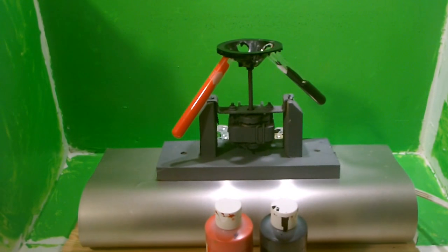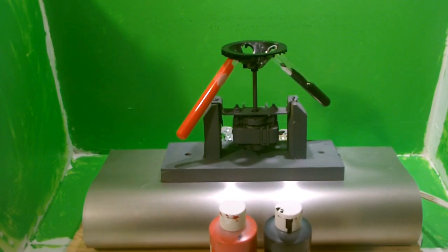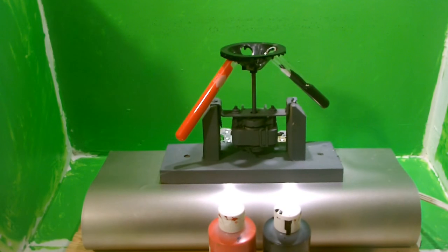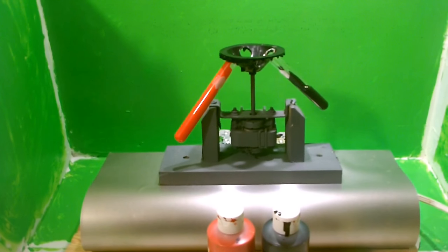So here is the centrifuge. It's finished and I just wanted to show it off. Show you guys if you ever needed something like this you could build it yourself for relatively nothing.